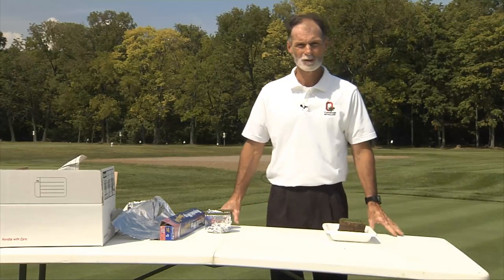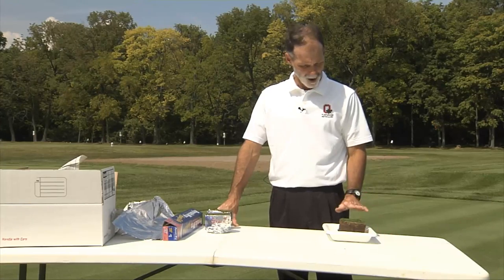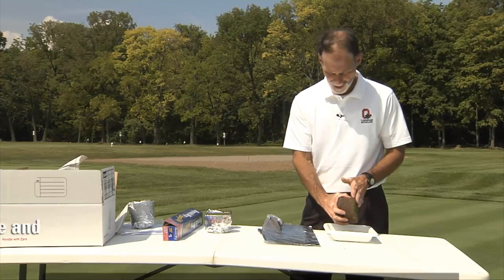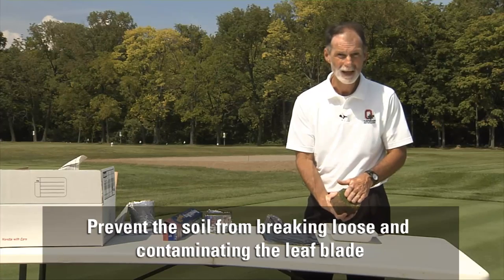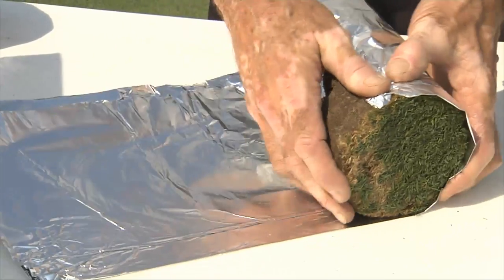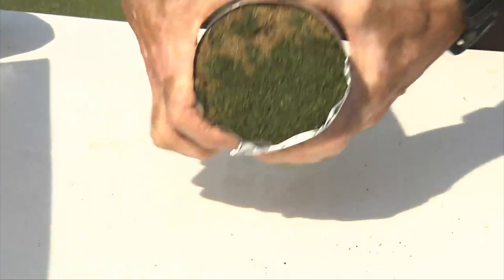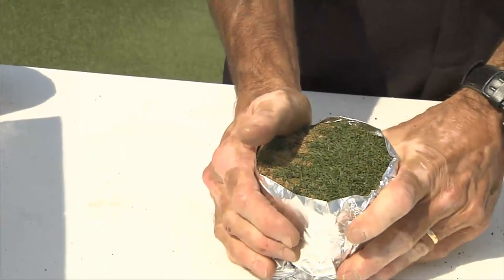The second part to have a successful and accurate diagnosis is to properly send the sample. Once you have the sample it is very important that it is wrapped so that the sand and soil does not work itself loose and contaminate or cover the leaf blades. You can use aluminum foil or newspaper and just wrap the sample securely, possibly tape it if you need to, but the key is to keep the dirt off the leaf blades.